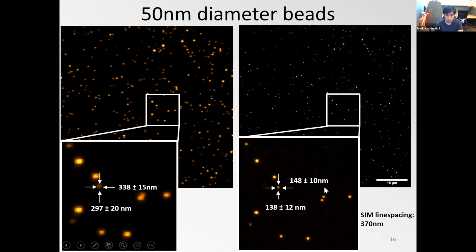And here, this is the same bead, around 150 nanometer resolution, fairly round. So we can state that the doubling happens relative to the baseline, the best resolution value of the OPM, which then essentially got doubled.